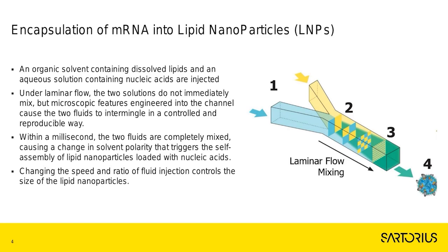And this is a very fast process. It basically takes a few milliseconds to mix both fluids, and by playing around with the parameters, so changing the speed and ratio of the fluids injected, we can control the size of the lipid particles being produced.